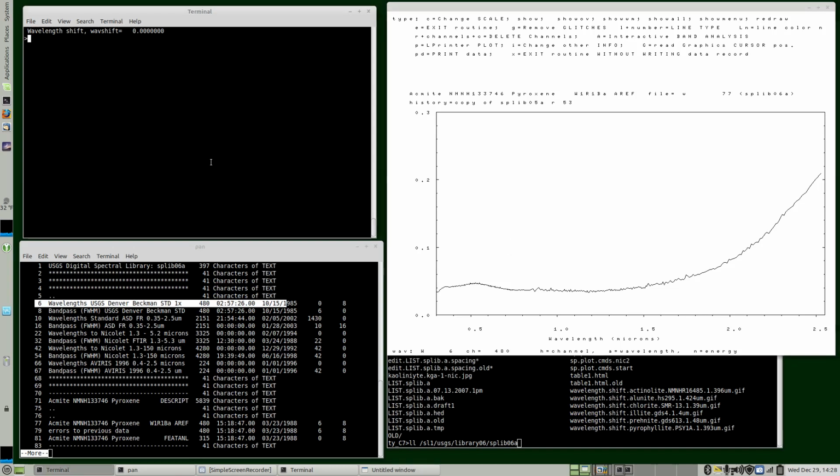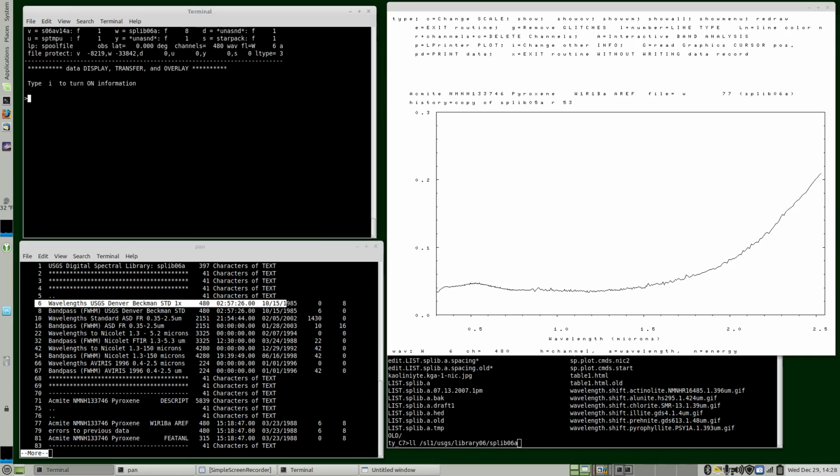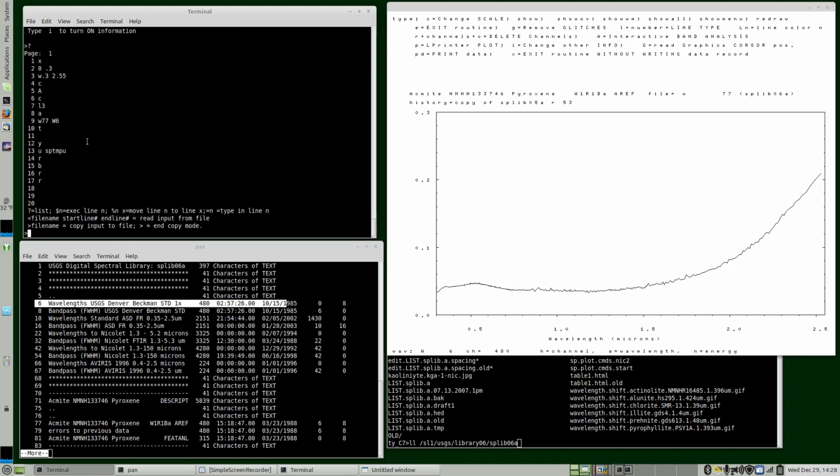Now let's do something different. If you do question mark, you see your history. So we typed W77 capital W6. Let's try W6 capital W77. And if you're ahead of me, it would reflect the spectrum onto this other axis.